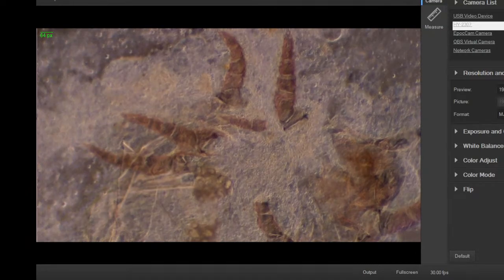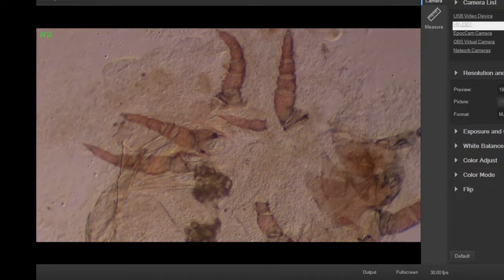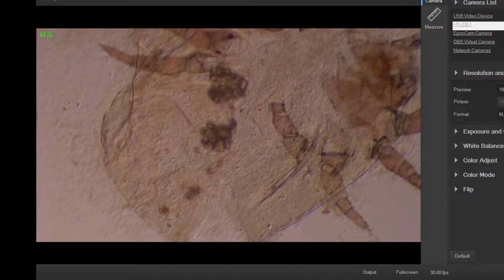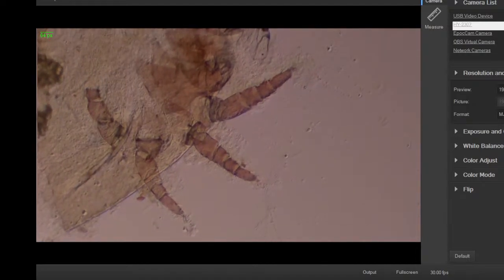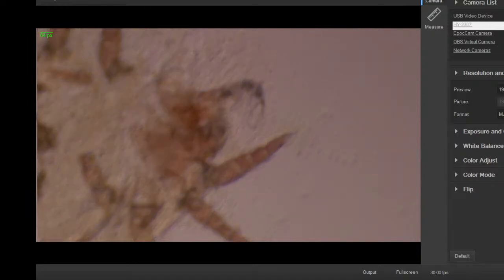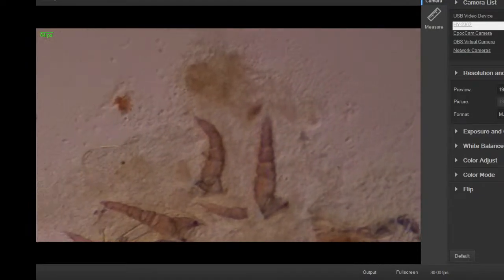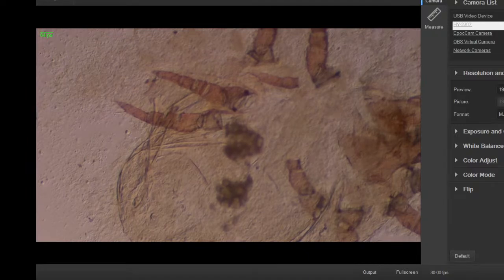Now let's zoom in a little bit and see what we can see. White parts. So the body squished pretty easily, but the legs are really sturdy. They're still intact. Let's get a little color contrast there. You really see the shape of the body still kind of intact a little bit. There's the legs. There's the head that got squashed. But the legs are roughly where they were, just splayed out a little bit more and separated.